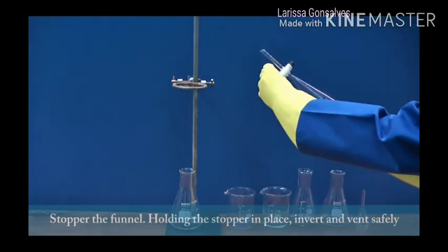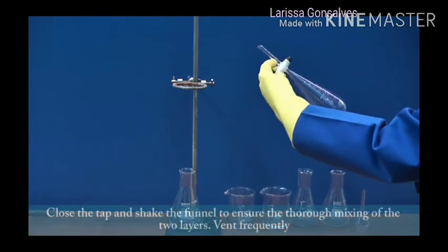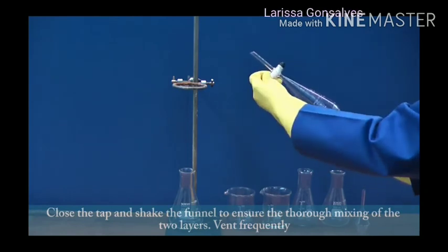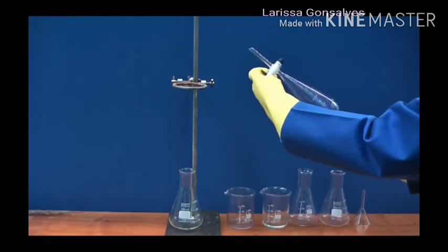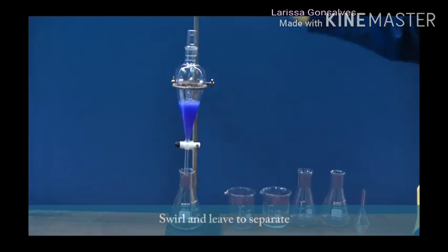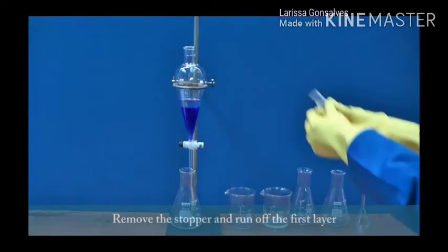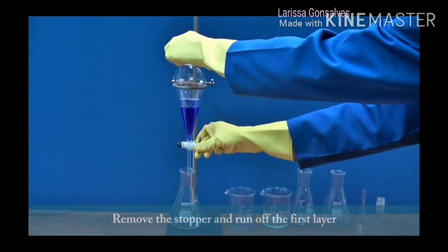Before shaking the aqueous solution along with the solvent, care should be taken that the knob of the separating funnel is closed. After time intervals, the knob is opened to release the pressure which is built inside the separating funnel. After shaking the solution inside the separating funnel vigorously, the separating funnel is kept on the stand in a stable manner so that the organic substance is extracted or separated from the aqueous solution. So here you can see the organic substance has been separated.